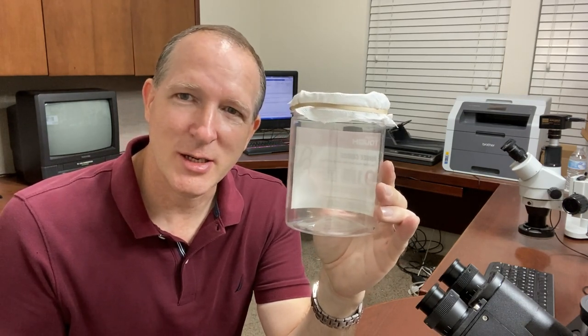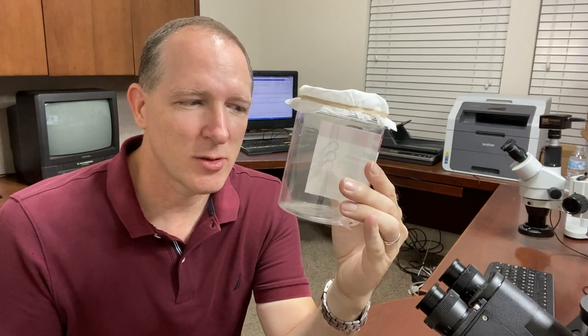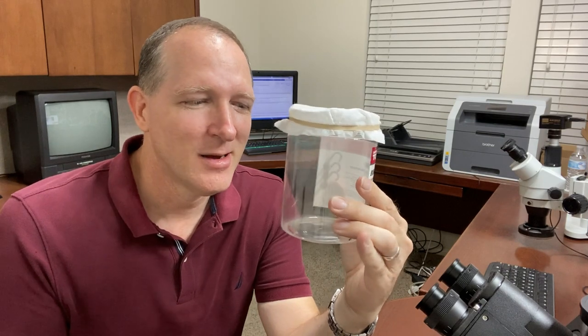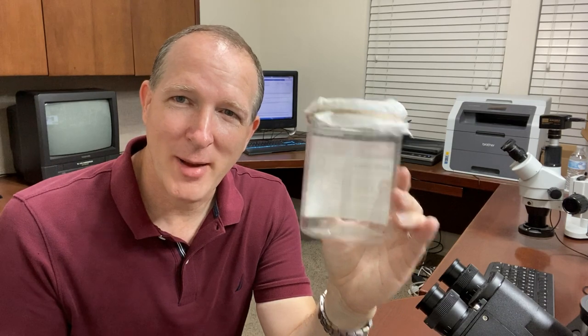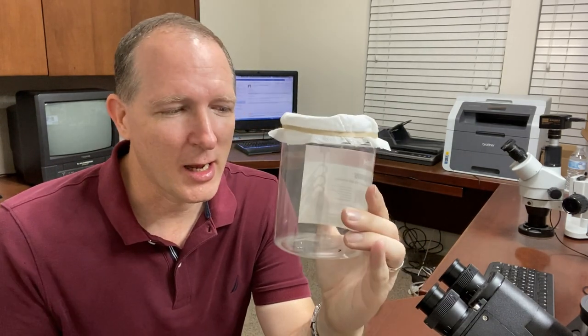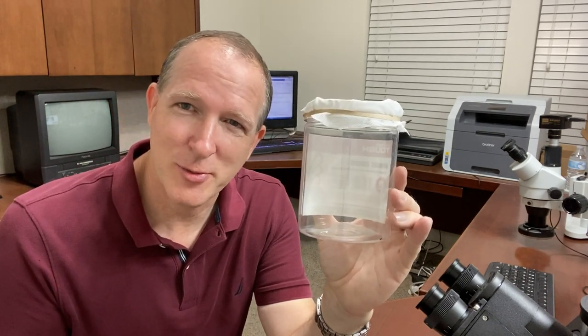And what I want to do is, after a couple of hours or so, I'm going to take the blood out of the mosquito. I'm sorry, I will have to kill it. All in the sake of science, right? Anyway, come back in a couple hours and we'll see what happened to my blood under the microscope. Stay tuned.